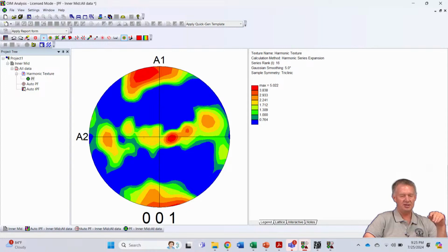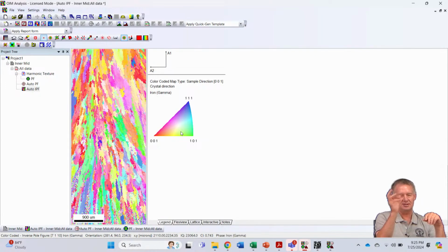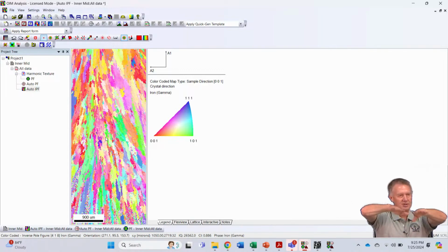Or you can see on this, this has axial symmetry, it's cylindrical symmetry. And you can see when we come off the exact center line here, it's pointing out to the outside. So maybe we're not on the exact center line where we cut it. So all these are actually pointing towards one of the sides or the other, right?